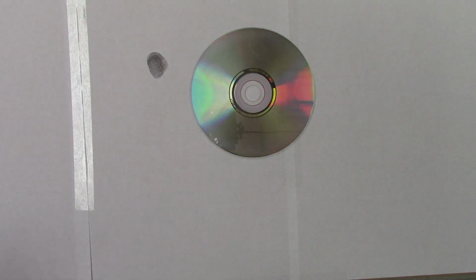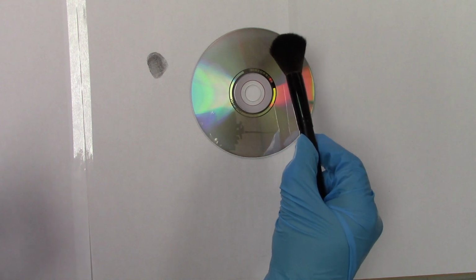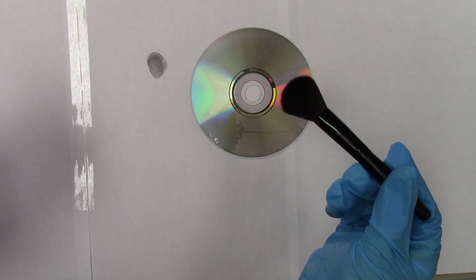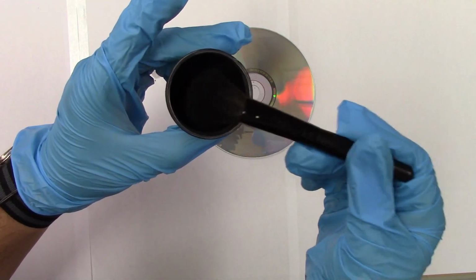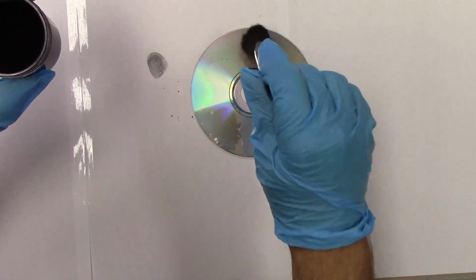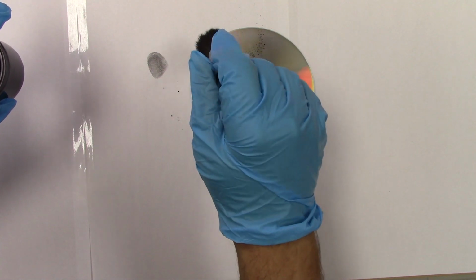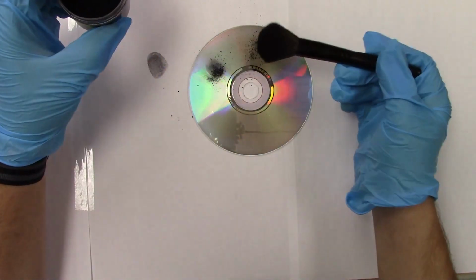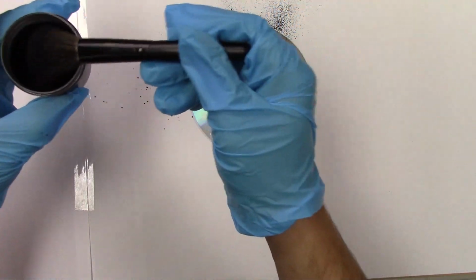It wasn't the cleanest. I smudged it a bit. Let's go like that. There we go. I made a print. All right, now this is where it gets messy. So you would come along with your fingerprint dust. I see the criminal touched this disc. Let's get that print, because it's not very clear right now. Okay, so you take a little bit of this dust, which is basically like pencil shaving-esque. You're going to put some of that dust. I don't like using the brush on the print like that. I find I smudge it. You can try it. I like applying dust gently around, and then see how messy this gets?